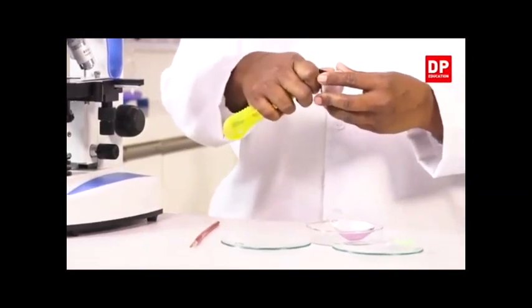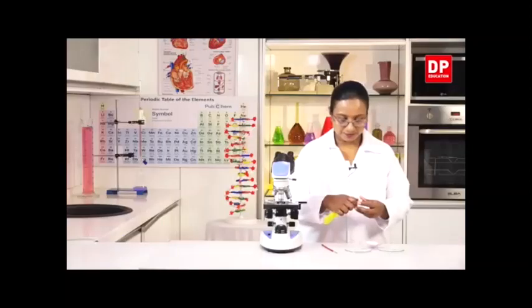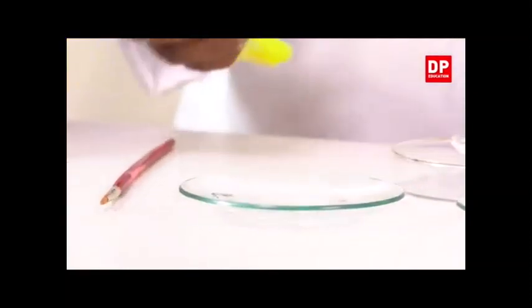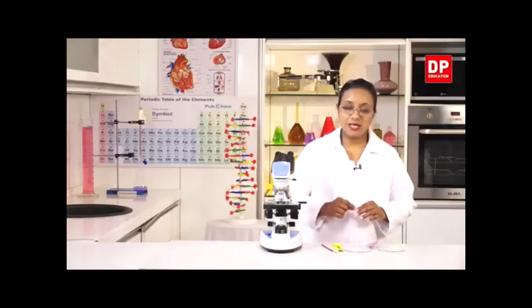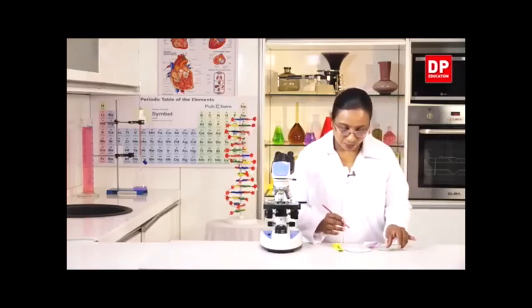It's better if you can take out more than one peel, so that you can select the thinnest one out of all the peeled out parts. Now I have 3 peels. Out of that I will select one of the peels which is more clear. I think this should do.